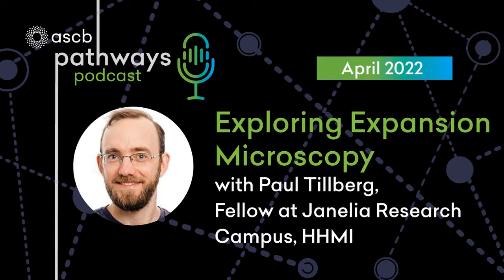Yeah, fun to think about, maybe. Fun to do, definitely not. But maybe there's this idea of cutting the thing up, and maybe 70 nanometers is not the optimal level to cut at. Because you have to do it mechanically, but doing it enzymatically ends up being the way to go. How did you come upon the polymer that you ended up using to expand the samples?